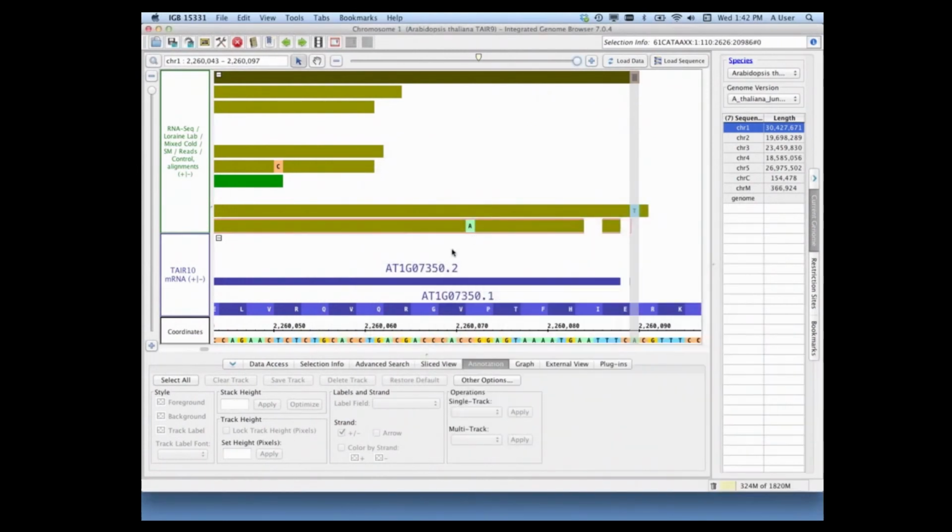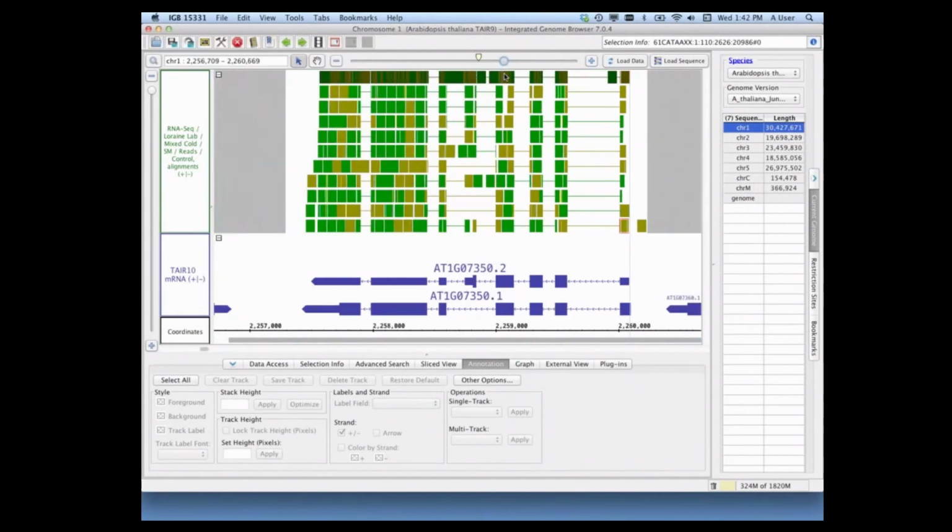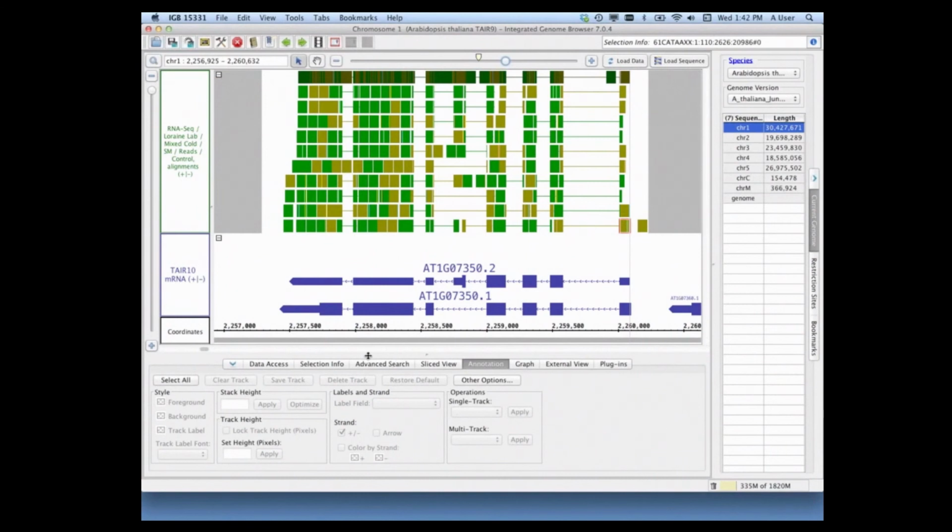That is the various ways you can use the sequence viewer and the sequence overlay in combination with your data analysis to get more information out.